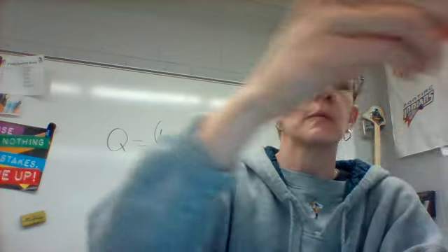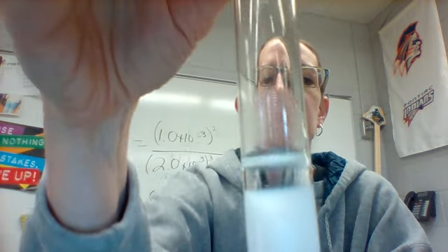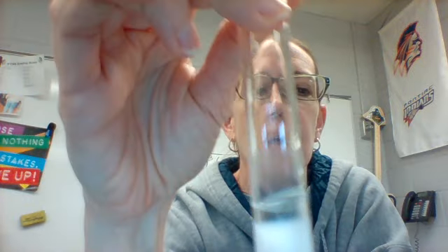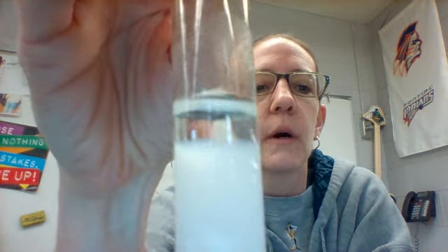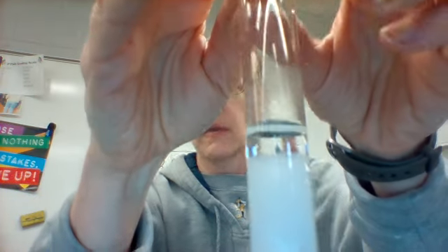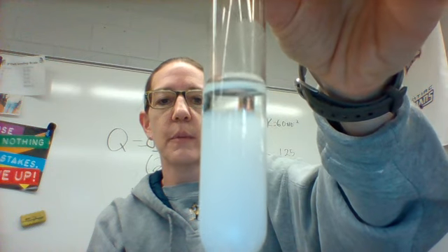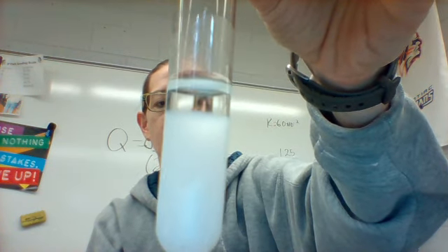And then the last one here that I told you I was going to wait and see if the precipitate settled out. You can see now, I believe this is the zinc acetate one, step nine I think. You can see that there's definitely clear liquid on the top now and the precipitate has settled down.